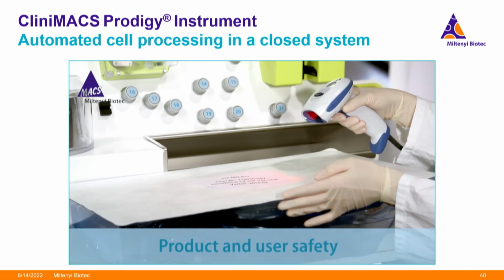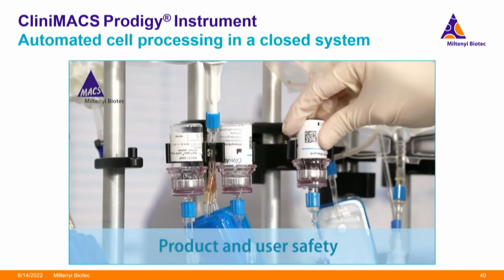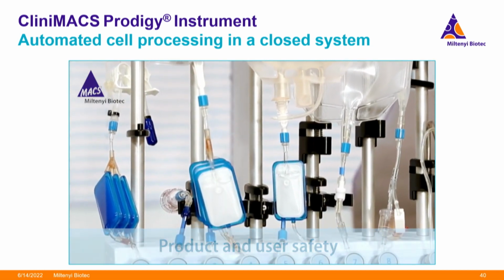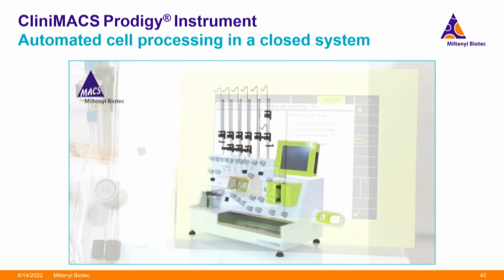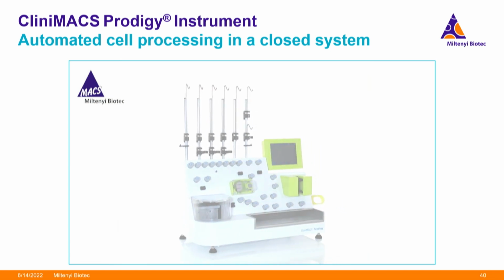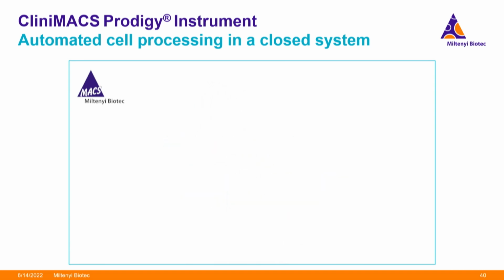And of course, this is a medical product, so it all needs to be sterile. Everything needs to be very well documented. It is all happening in a clean room. So the people that use our software are wearing masks and gloves, and absolutely no errors should happen because this is patient material, and the instrument and the software need to work very, very stable.